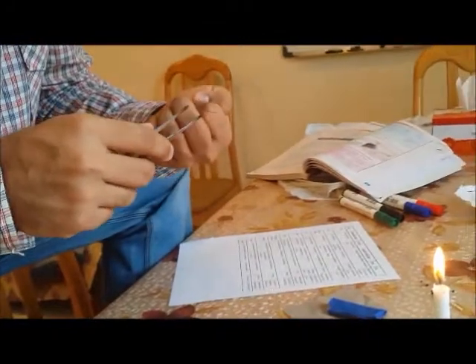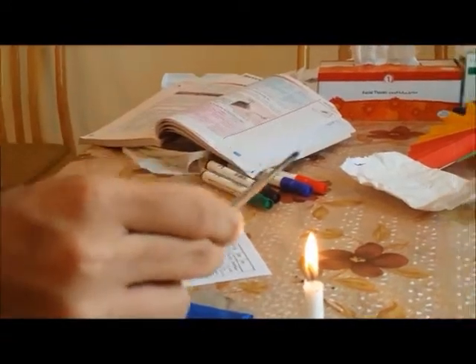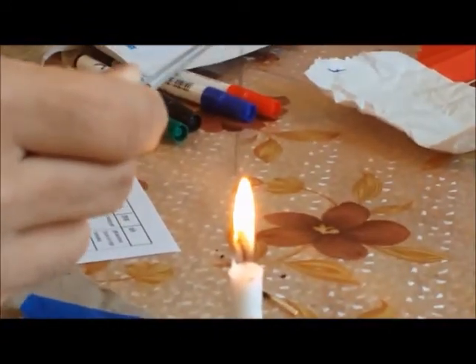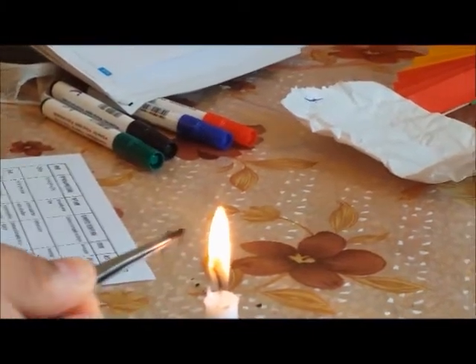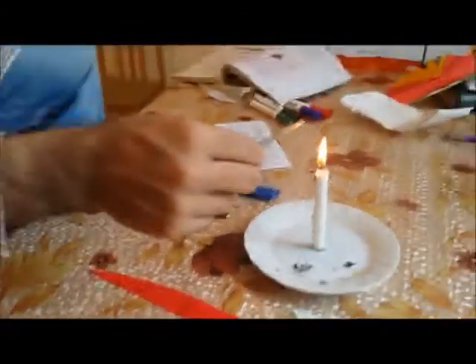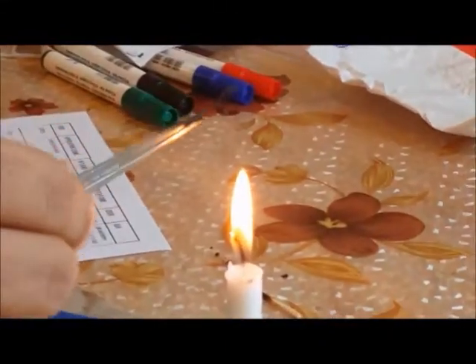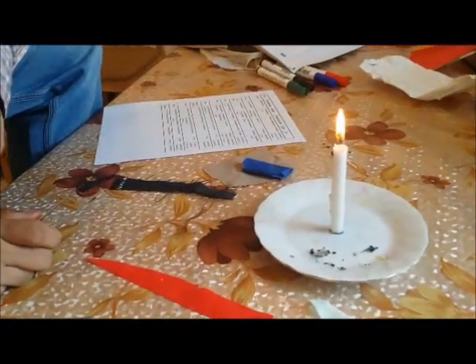Don't forget to wipe it. Now you can see what happens with this — it is also curling away. Curled away, not burnt. Let's take two pieces this time and see. Curling away. Curling away is happening with the silk also, so can we say this is silk? No.